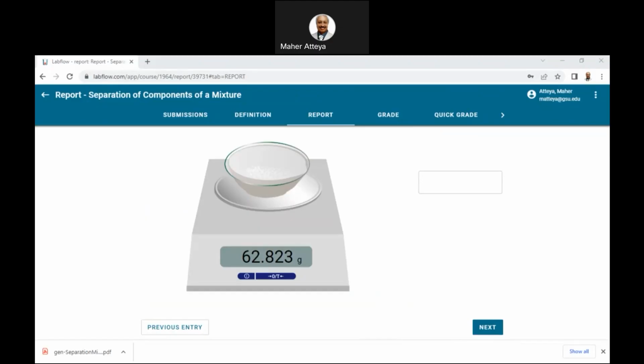The white crystals of the salt will form, and we will keep heating till all water drops are driven away from the crucible.